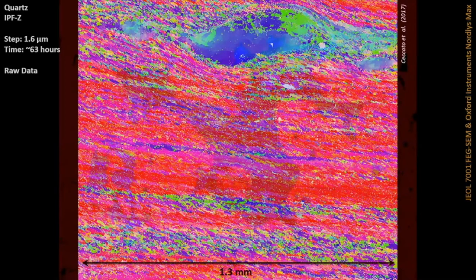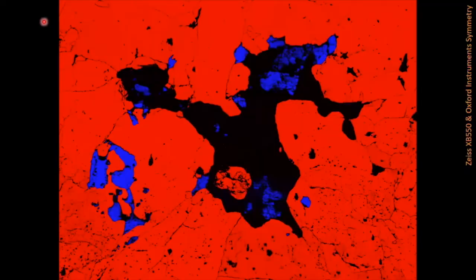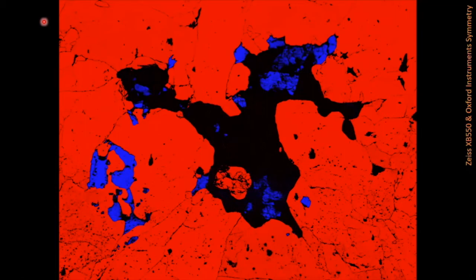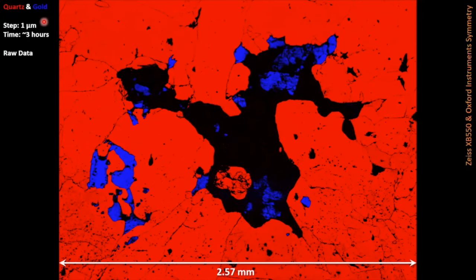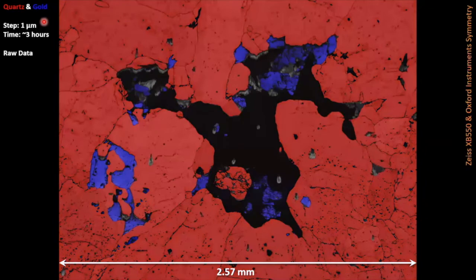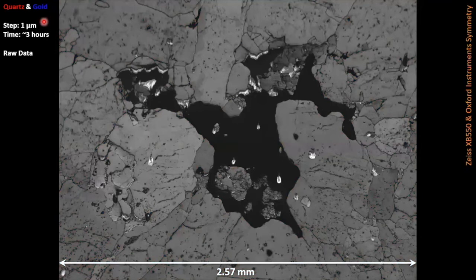Thankfully, electron backscatter diffraction has improved. We had some new-generation detectors a couple of years ago which allow us to look at much larger areas much more quickly. This is another earthquake sample — again lots of quartz. This is a phase map where all the red on screen is the quartz crystals and the blue is actually gold mineralization within that quartz, from a particular earthquake zone. We were able to analyze this area with a smaller step size — better resolution than the previous map — and this one only took three hours rather than 63 hours, with a quite a lot larger area as well.